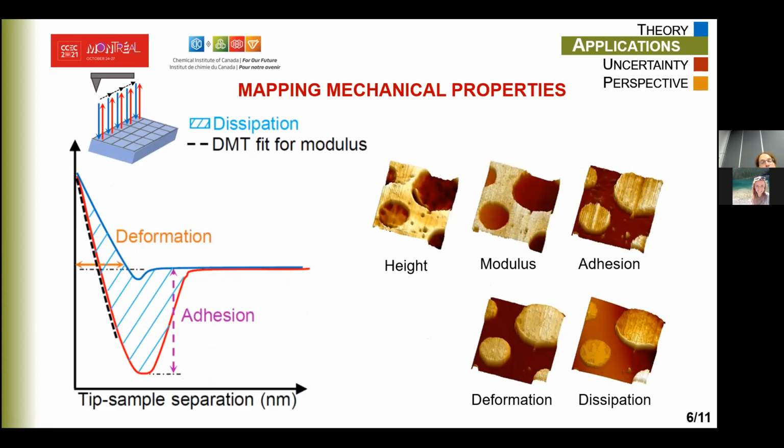First, it's the nanometer lateral resolution of AFM. Its mapping speed, which is orders of magnitude faster than that possible using a nanoindenter. And finally, because quantitative nanomechanical information can be obtained for samples ranging from soft organic materials, where the elastic modulus is of the order of 1 kilopascals, to hard metals, where here the elastic modulus is more of the order of 100 gigapascals.